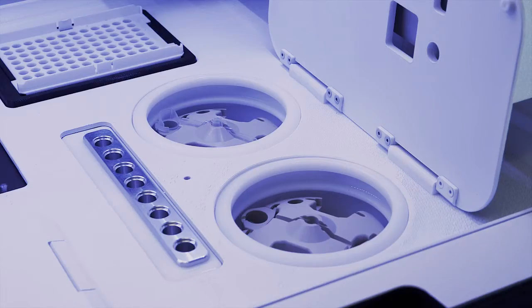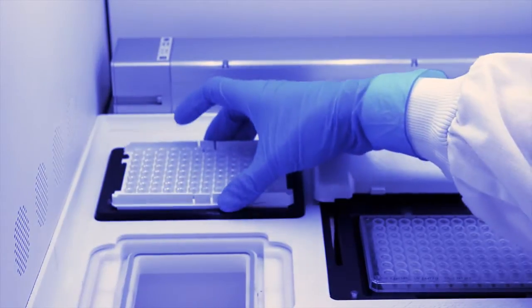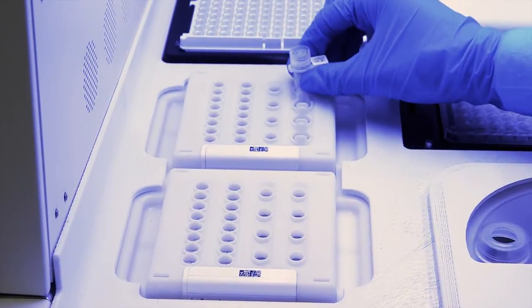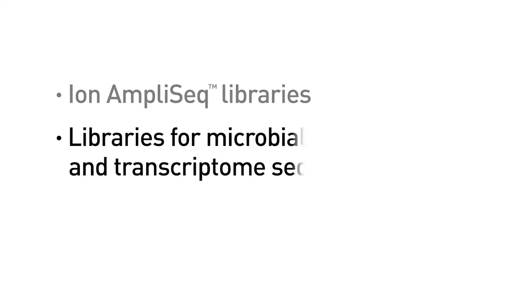Start setting up the run by placing the reagent cartridges and consumables on the deck. Load your library samples into the Ion Chef system. You can use Ion AmpliSeq libraries for targeted DNA or RNA sequencing, or libraries for microbial, exome, or transcriptome sequencing.